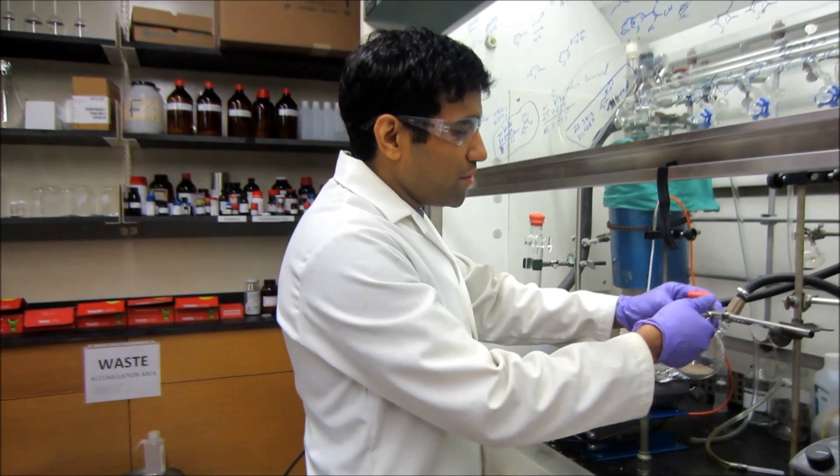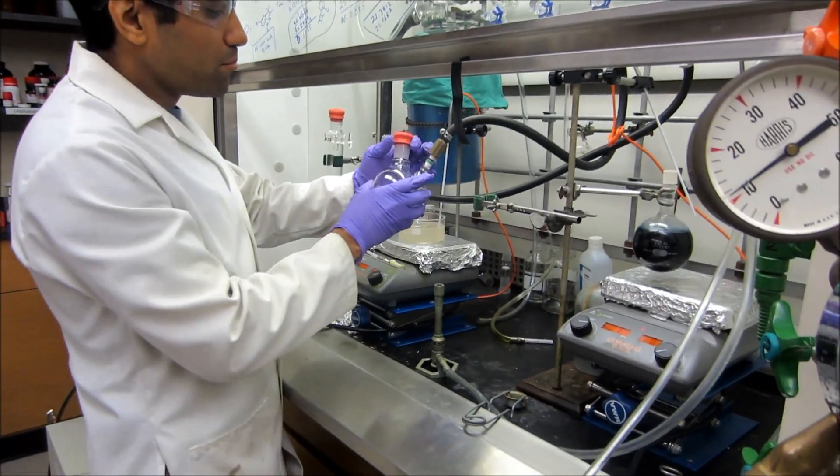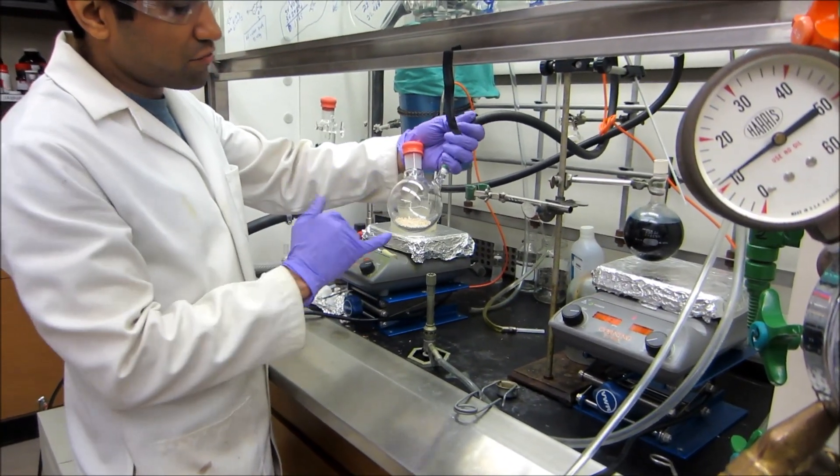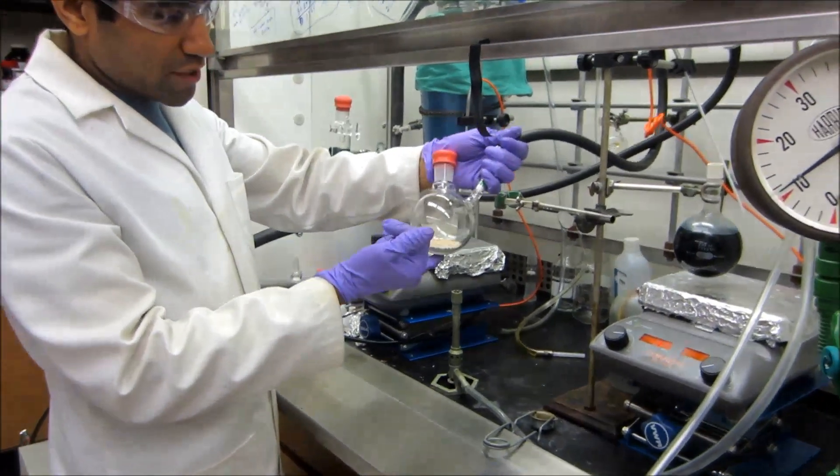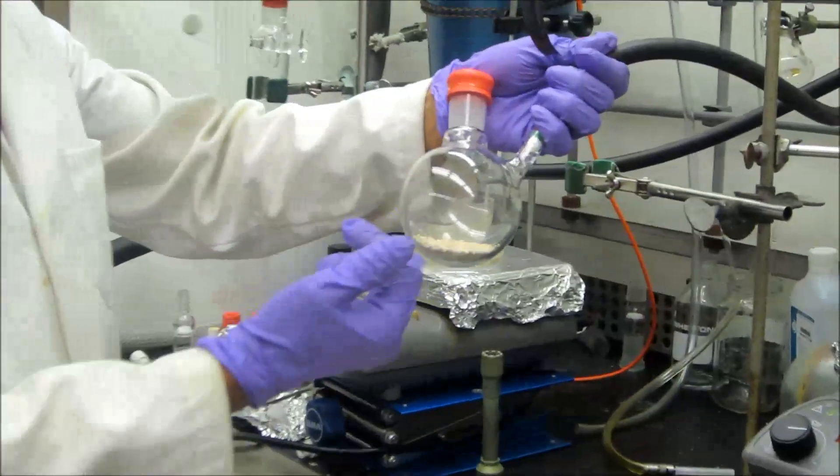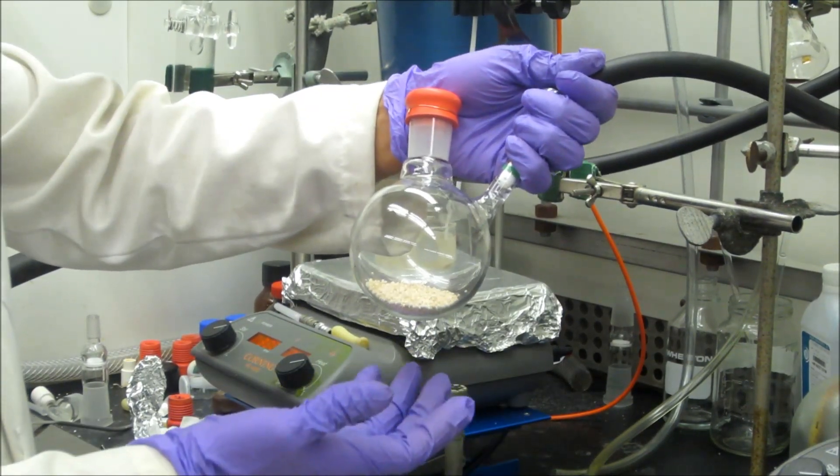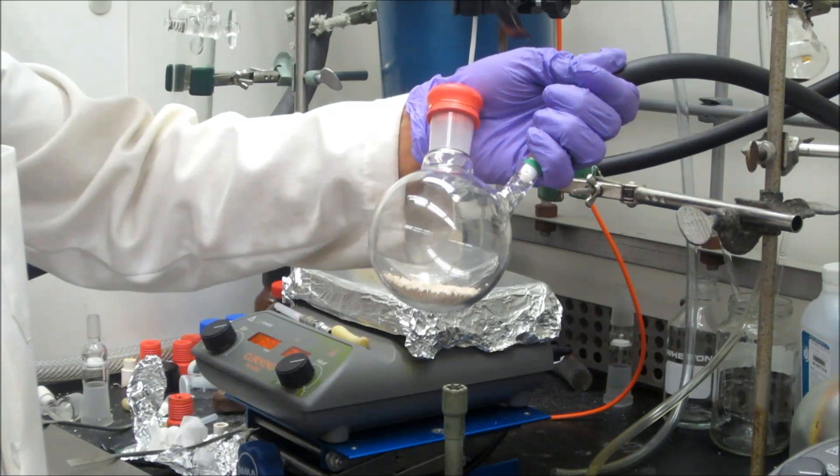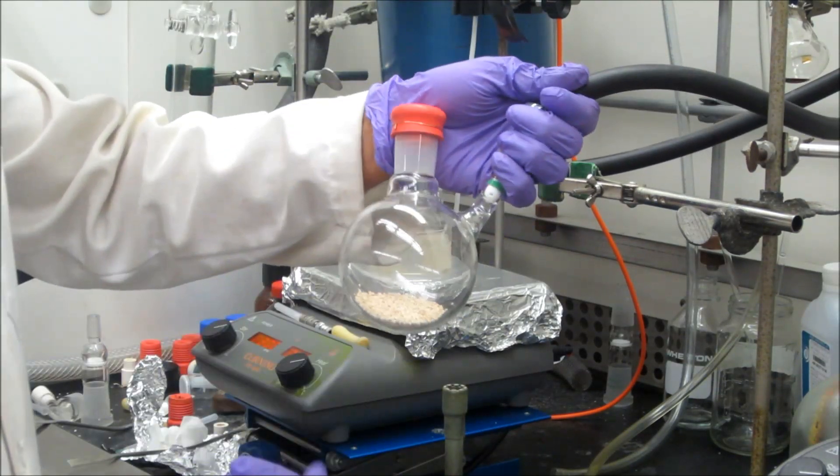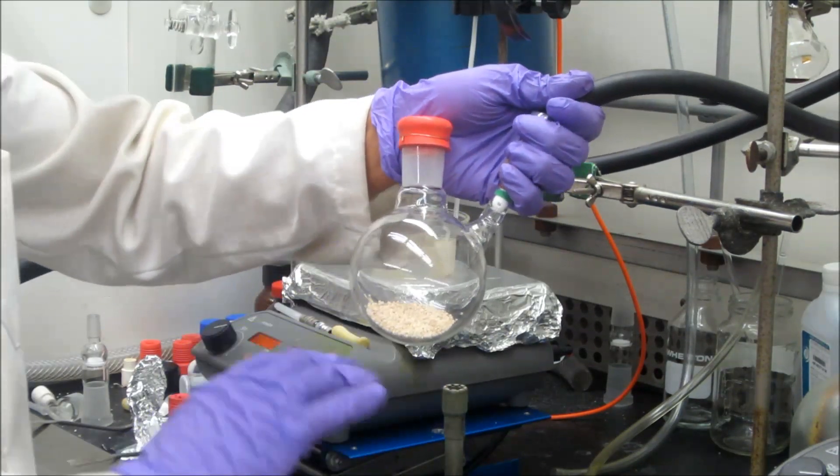So to dry the sieves, you really need to start with an airtight setup. You start with a schlenk flask that has some molecular sieves. These can be sieves that have come from the oven or sieves that have just been sitting around in a jar somewhere. The entire purpose of this exercise is to ensure that these are really bone dry.